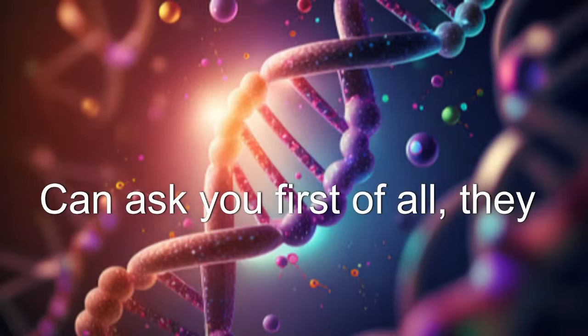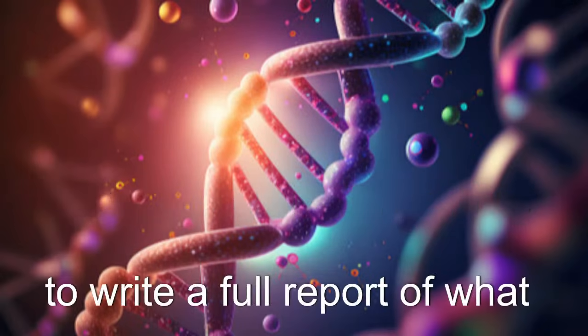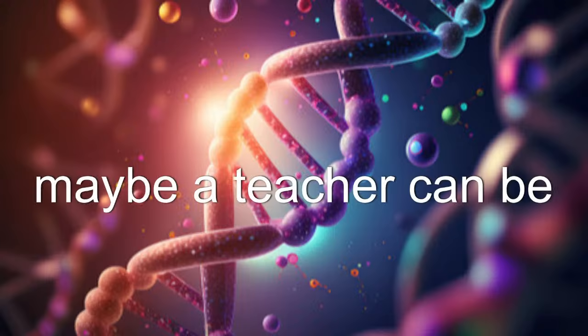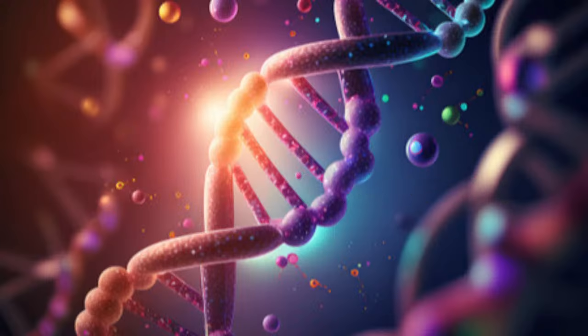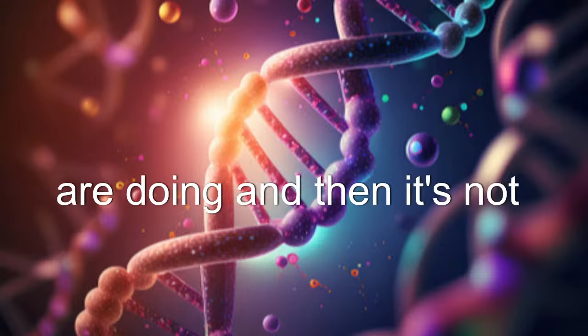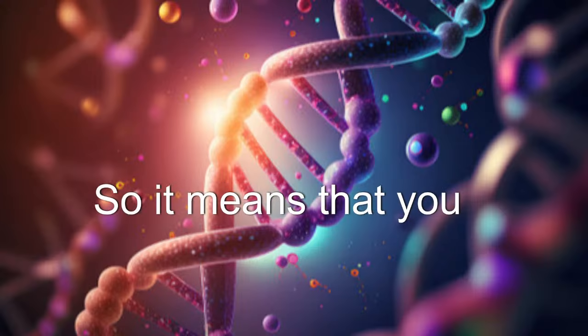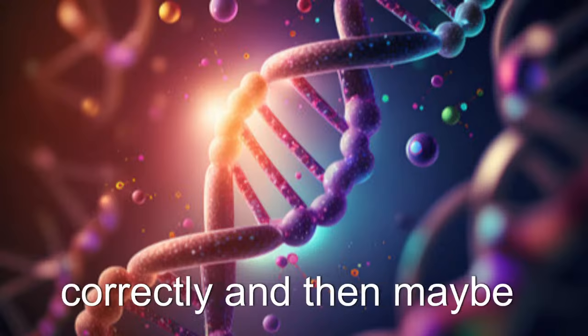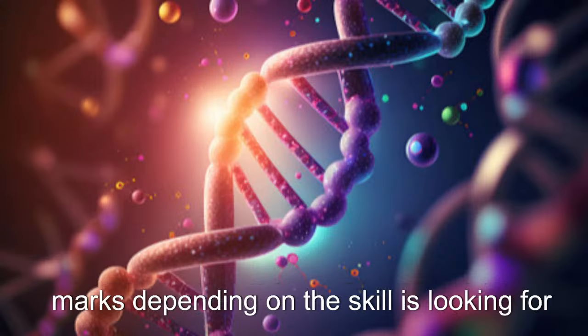They can ask you, first of all, to write a full report of what you have done. Number two, maybe a teacher or an instructor can be observing what you are doing and not saying anything. So it means that you're supposed to be doing the steps or the methodology correctly, and then they can be awarding marks depending on the skill they are looking for.